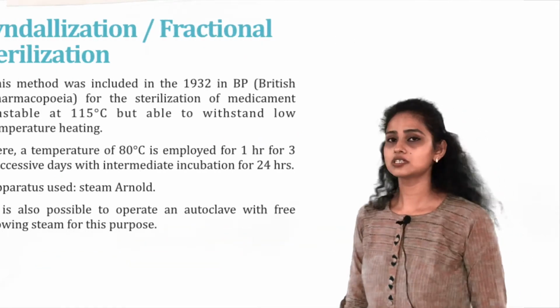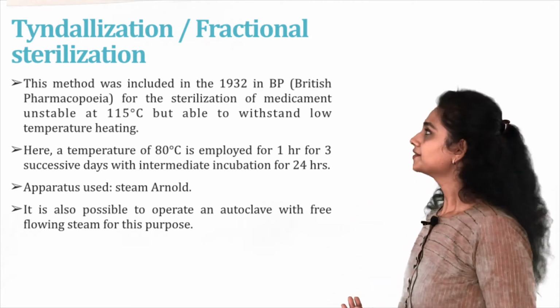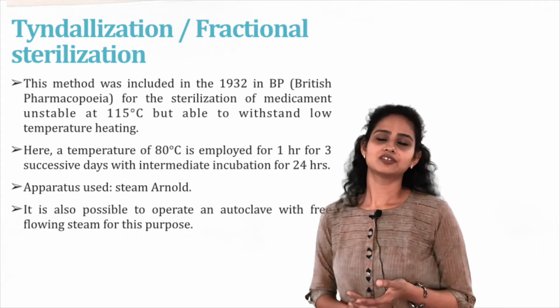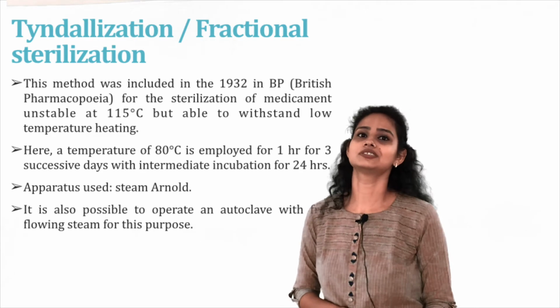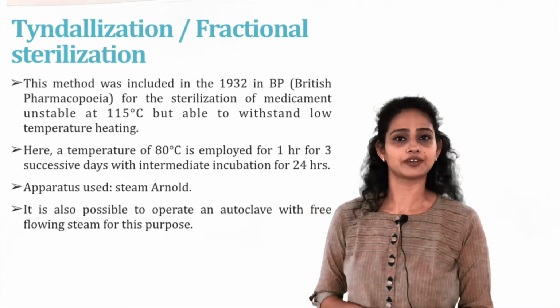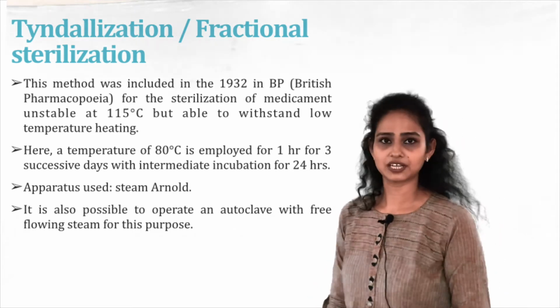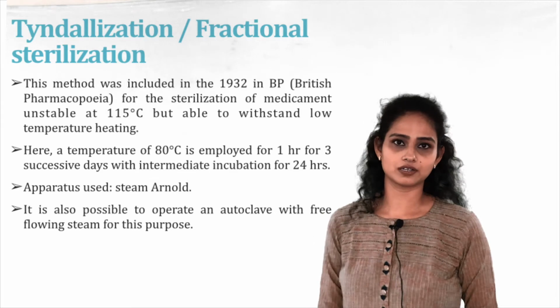Now, the next method is tyndallization, which is also known as fractional sterilization, right. This method is official in BP. This is the method for the products which cannot withstand 115 degrees Celsius temperature, right. But if they can withstand 80 degrees Celsius temperature, then this method can be used. At 80 degrees Celsius, it is difficult to kill microorganisms.